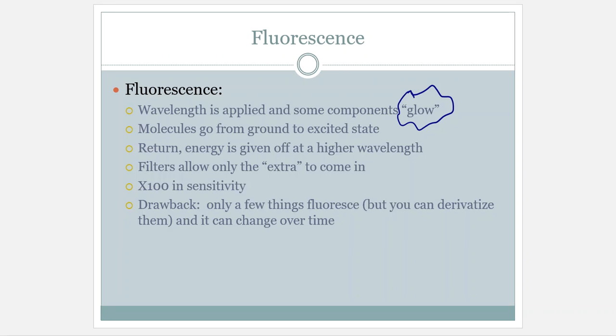Because the equivalent here is what I like to say fluorescence is all about. Imagine you being in a completely dark room. Completely dark. I mean, there's nothing in it at all. It is completely closed off. No doors, no windows. I've locked you up and I'm not going to let you out. And then let's say the only thing that you have is a flashlight, and you're going to turn that flashlight on. Okay, so what you're going to see is a very obvious area where the flashlight is turned on. That is fluorescence at its heart.